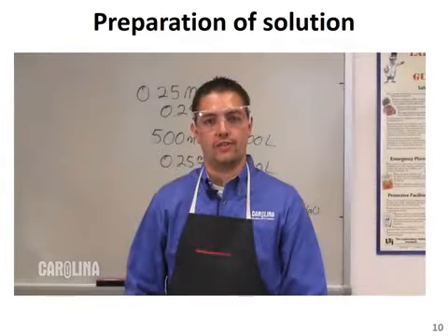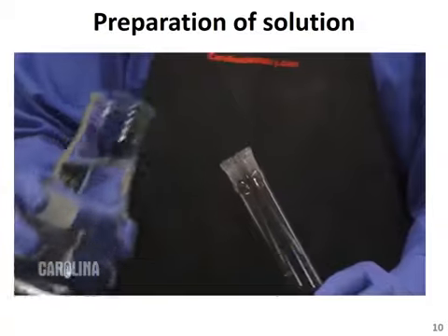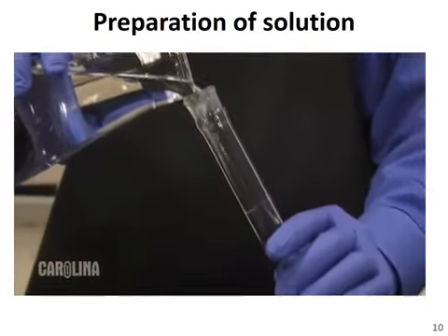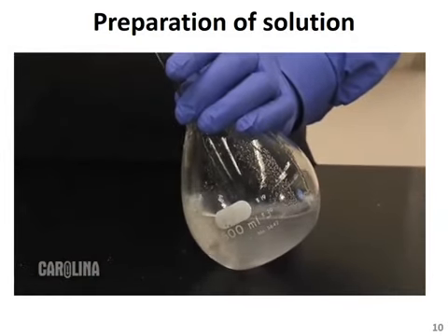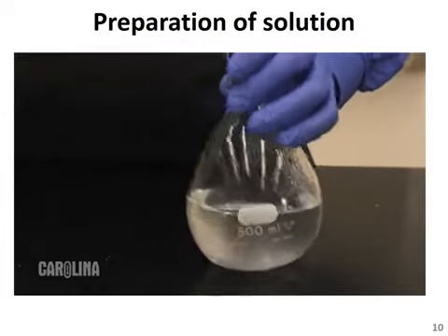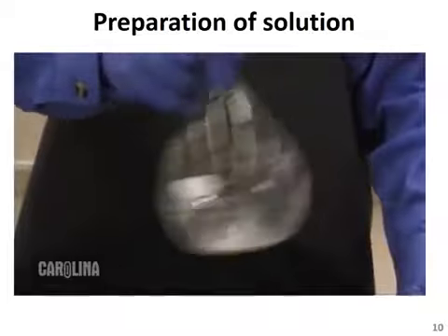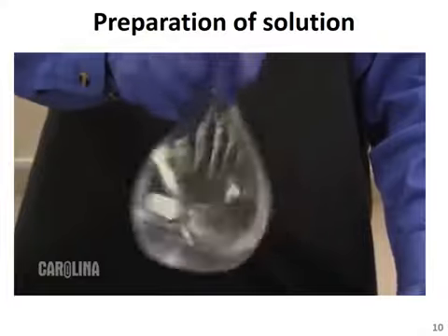Here, we just transferred our solute to the 500 milliliter volumetric flask. If any solute remains on the weighing paper, use a spatula or a small amount of water to transfer the remaining salt. Next, add enough water so that the bulb area at the bottom of the flask is approximately half full. This will give you enough room to swirl the liquid, allowing the solute to completely dissolve. Again, it's critical that all of the solute is dissolved prior to filling to the appropriate volume, as different solutes may take up more volume in solution than their undissolved salts.